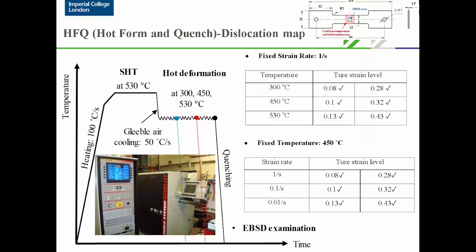High entropy alloys, I do not have much experience in it, but I think this method is applicable to most of the metals as long as you have the correct way to measure the microstructures and the dislocation densities. Yeah, and I agree. I'm sure we have a lot of Gleeble users out there that are doing this, and if they were unmuted, they would chime in and agree that similar models can be applied.